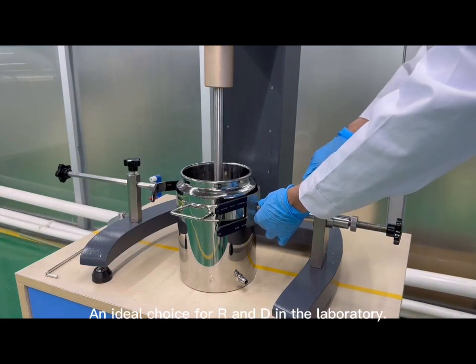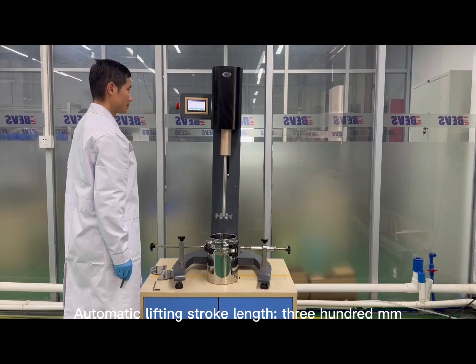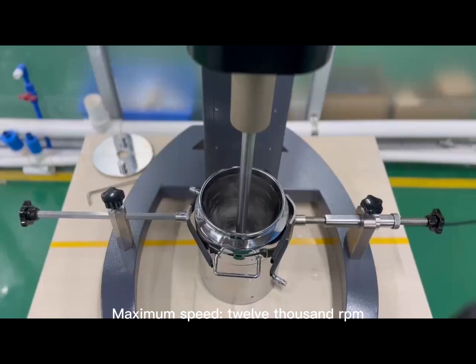An ideal choice for R&D in the laboratory. Automatic lifting stroke length: 300mm. Maximum mixing volume: 10 liters. Maximum speed: 12,000 RPM.